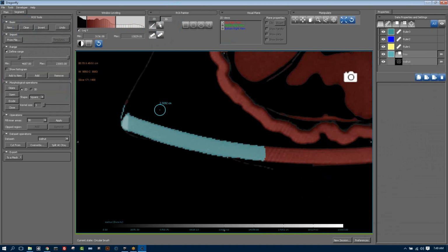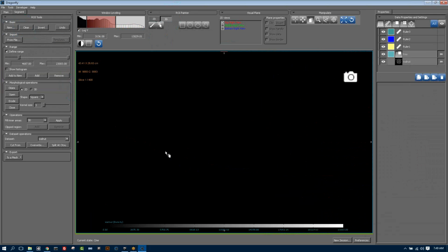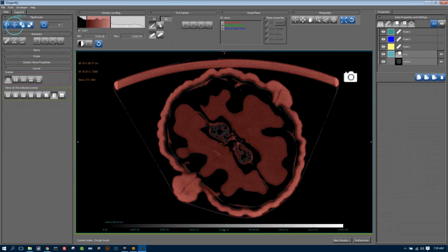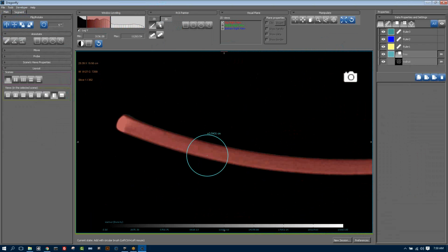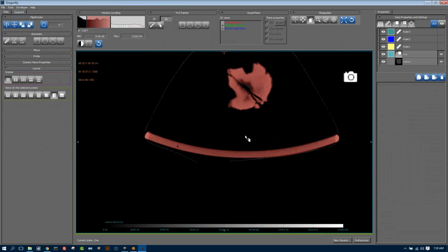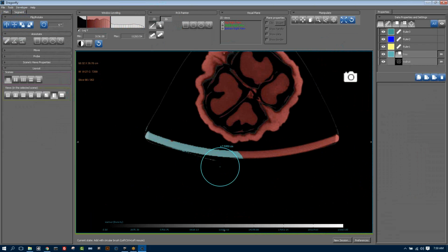slices. So if I were trying to do this and do something quick, I could go all the way back down to slice 0 and then scroll through the data. Whoops, let's fit the data to screen, and we'll just increase the brightness. And for this to be useful if we are on an XY slice, so we'll just do this. So what we could do is go down to the very first XY slice and paint through like this. Now if I wanted to paint the entire tray, I could do this without too much effort. We could probably paint it in about 30 or 40 seconds.